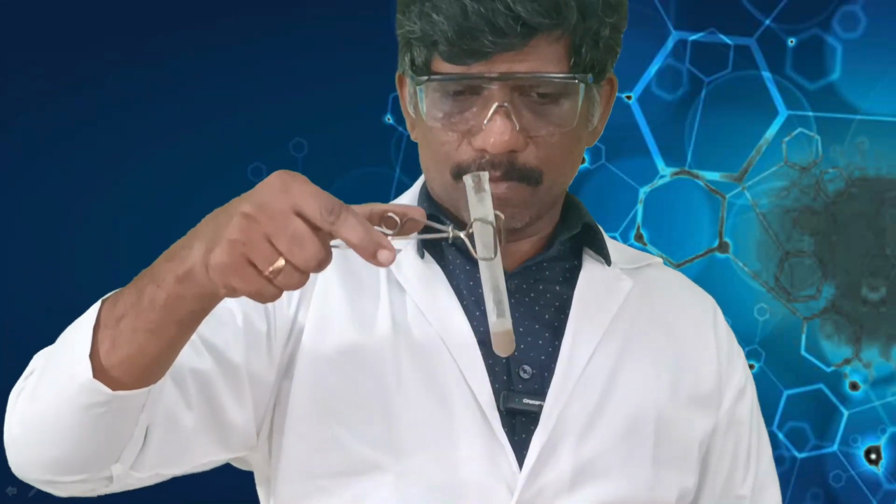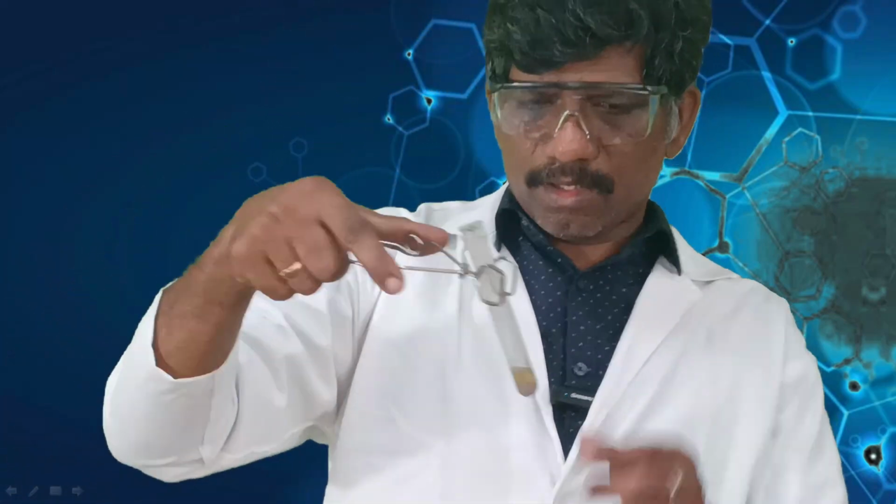Formation of a white precipitate. You can see the formation of white precipitate all over the tube here and also here. Okay, this is called urea nitrate. Formation of urea nitrate is one of the tests to confirm the presence of diamide.